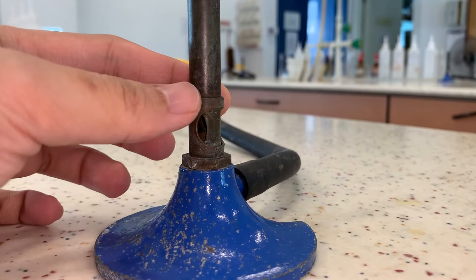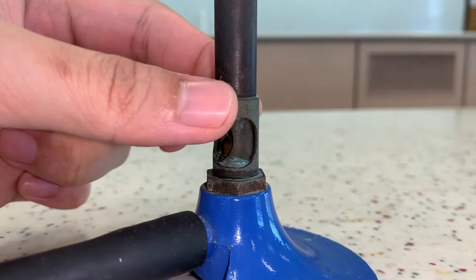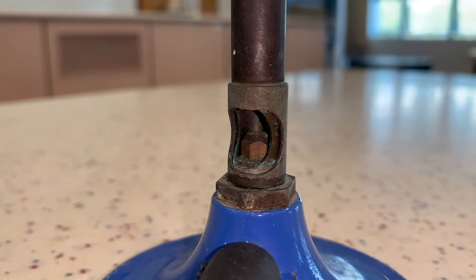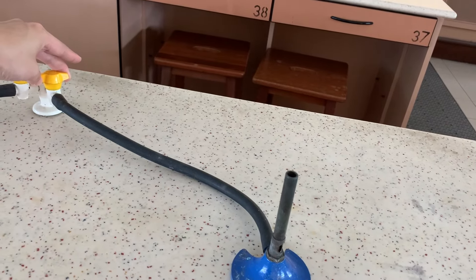When lighting up the Bunsen burner, it is important to close the air holes first. If you light the Bunsen burner with the air holes fully open, you may get a strike back. A strike back occurs when there is too much air entering the air hole — instead of burning at the top of the barrel, the gas burns at the jet. Turn off the Bunsen burner immediately as it is extremely hot.